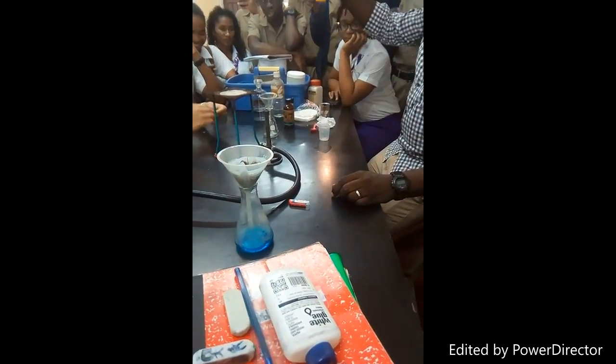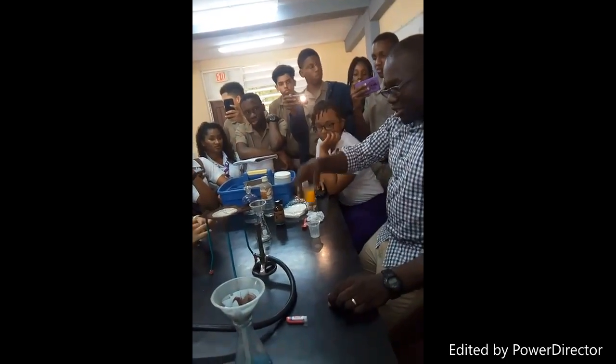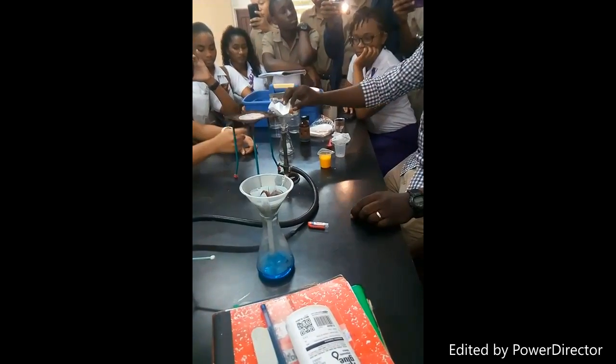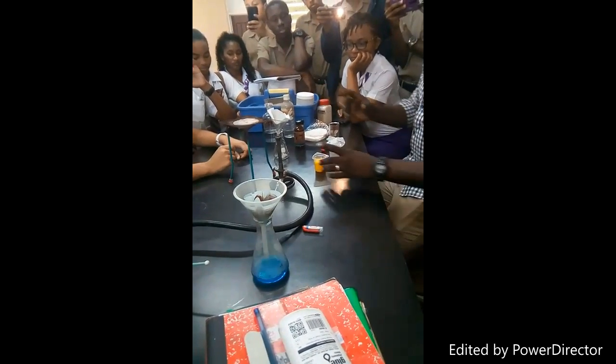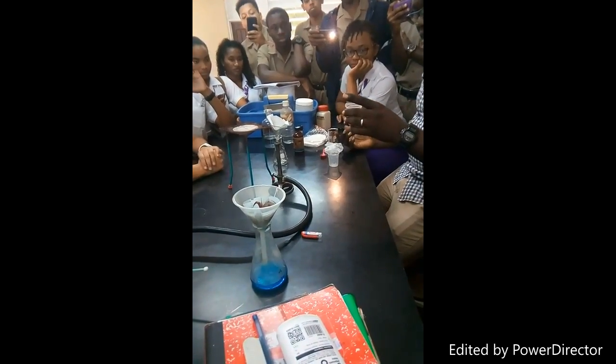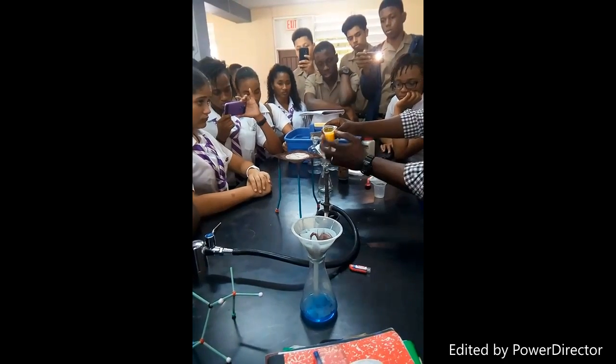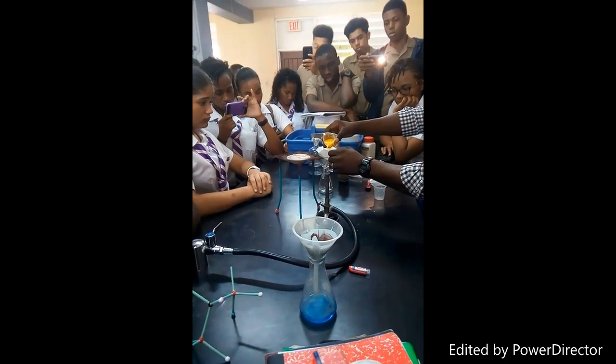So this bright looking yellow substance is lead iodide. Okay? Now what I'm going to do, this is a solid because we said it's an insoluble salt, so therefore it's a solid, and I'm just filtering it. So what did I do first? I mixed my solutions. Now I'm filtering.